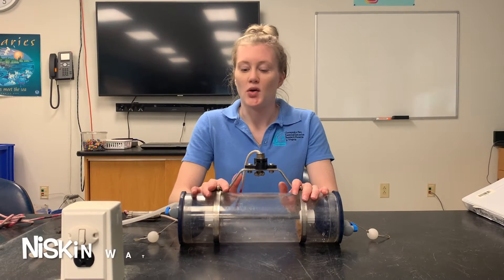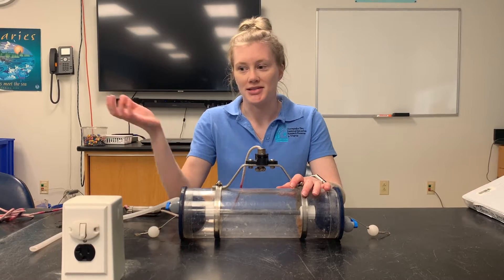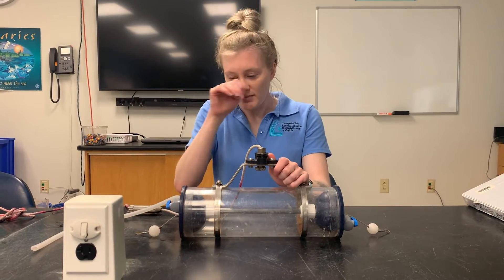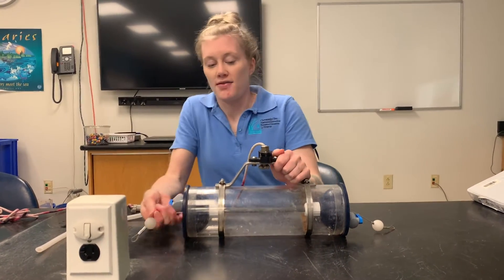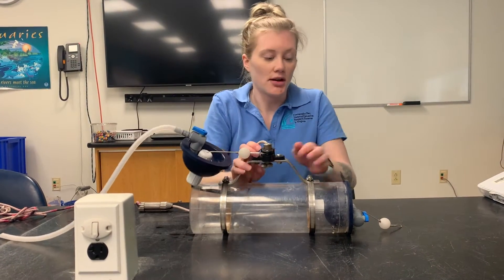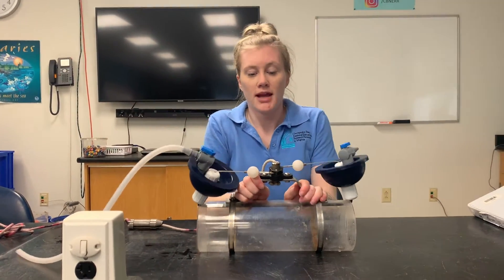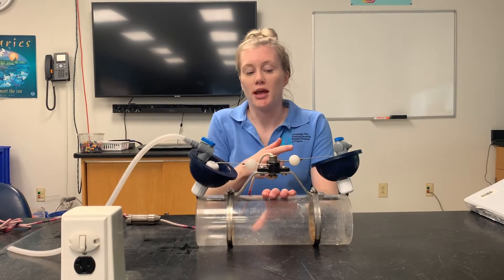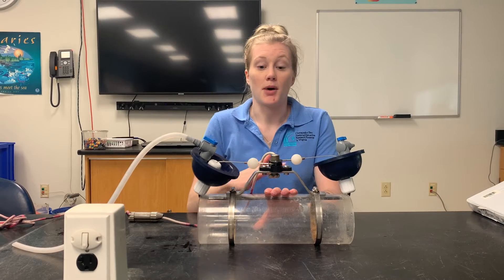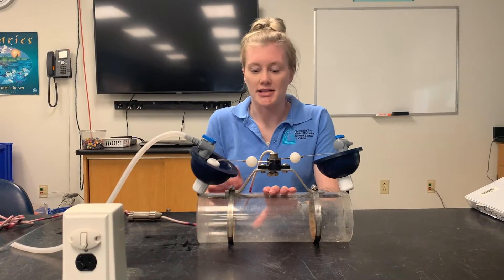The first piece of equipment is a Niskin bottle. This is a device we use to collect a water sample that we just can't reach over the boat and sample ourselves. It has two ends with giant suction cups — you pull those ends and clip them into the top. Once both ends are attached, you lower the Niskin bottle down to the bottom. Once you reach the bottom, you bring it up just a little bit so you're not collecting sand and mud in your sample.